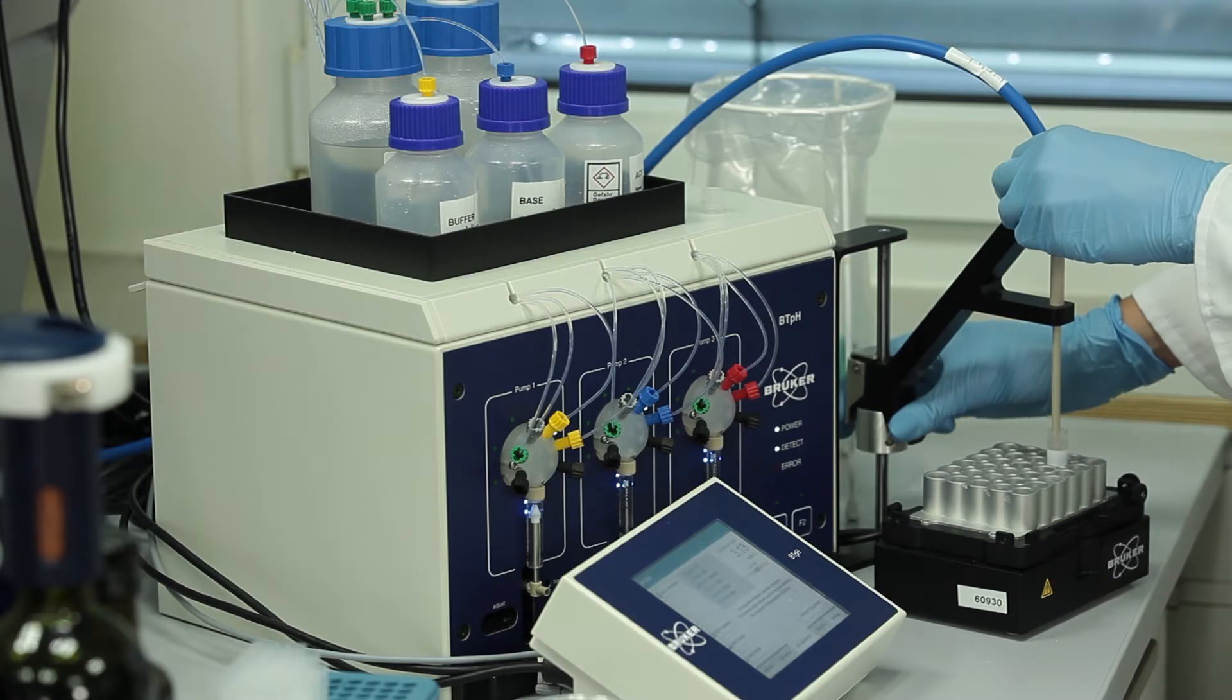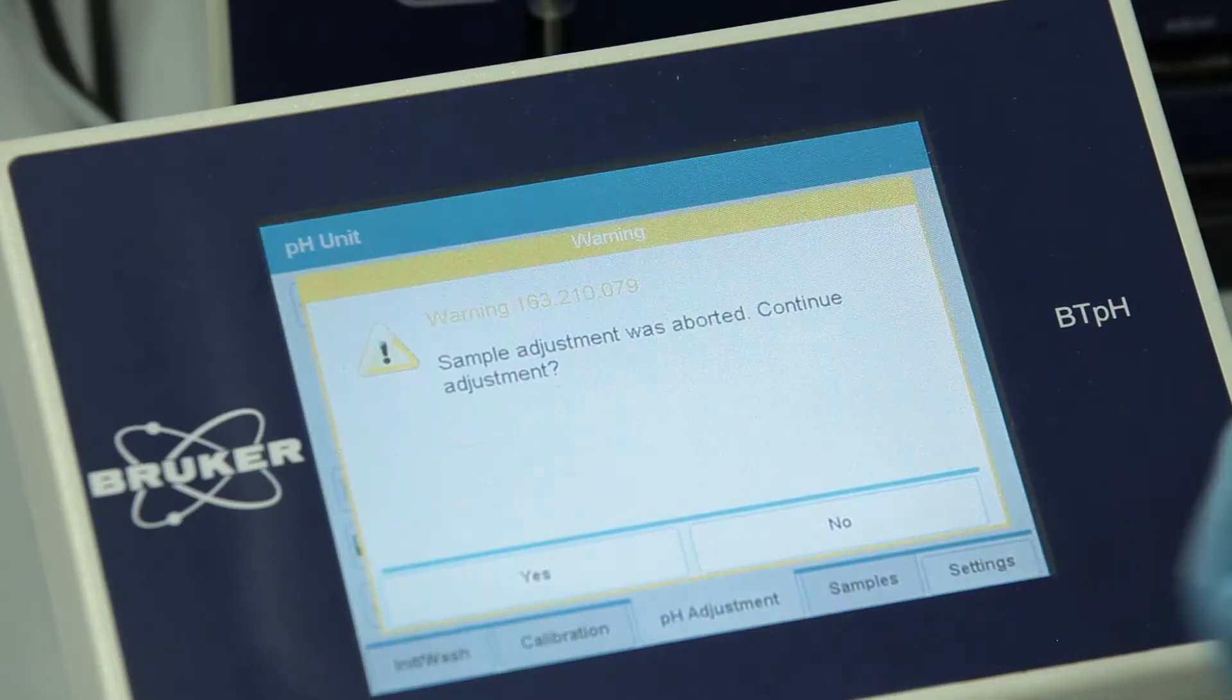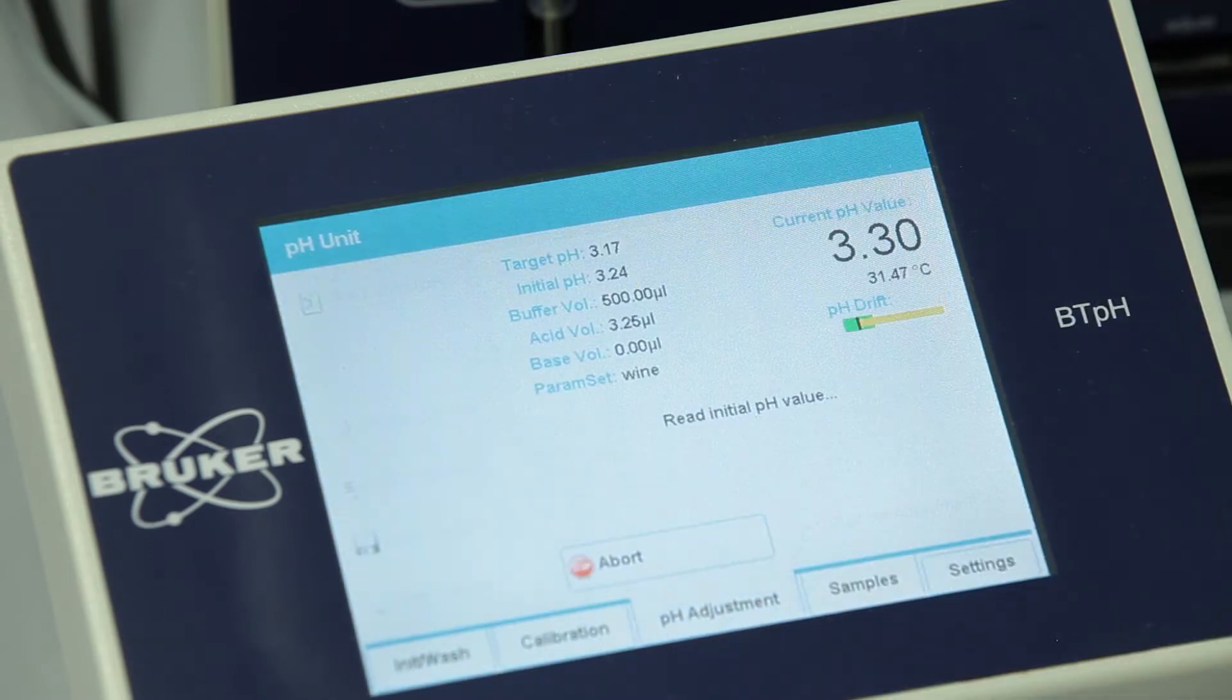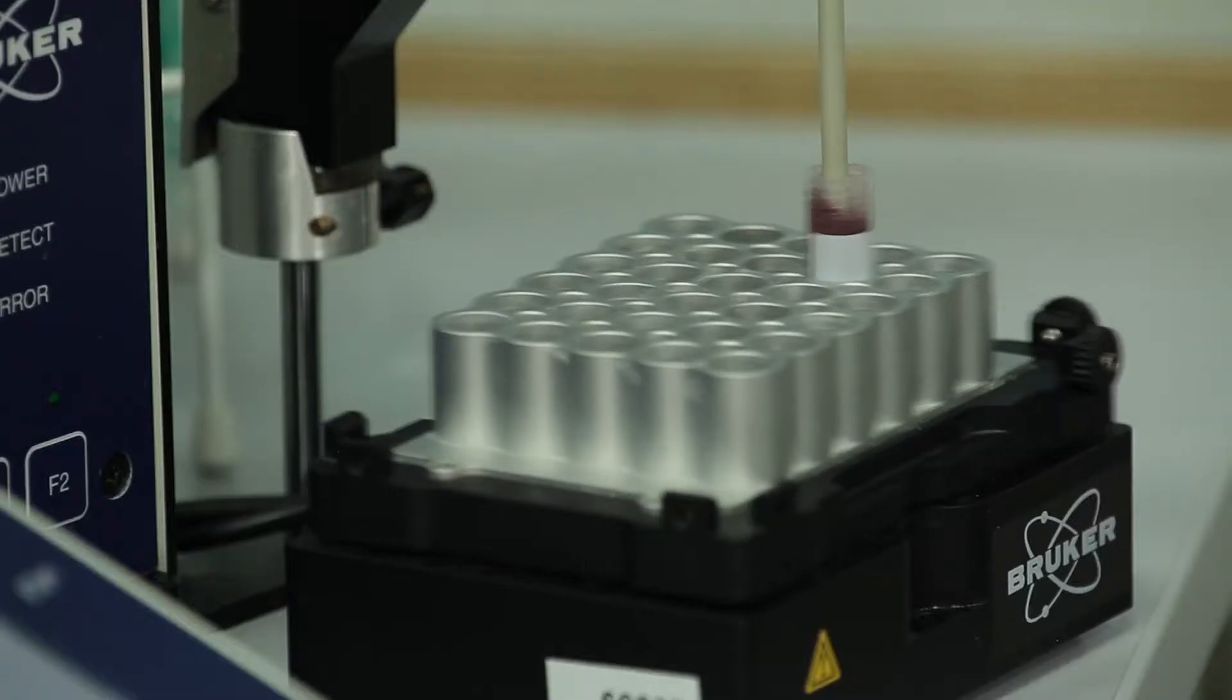Bruker's BT-PH unit was especially developed for small volumes to save time, reduce manual interaction and to generate precise dilution factors as needed for high-quality quantification.